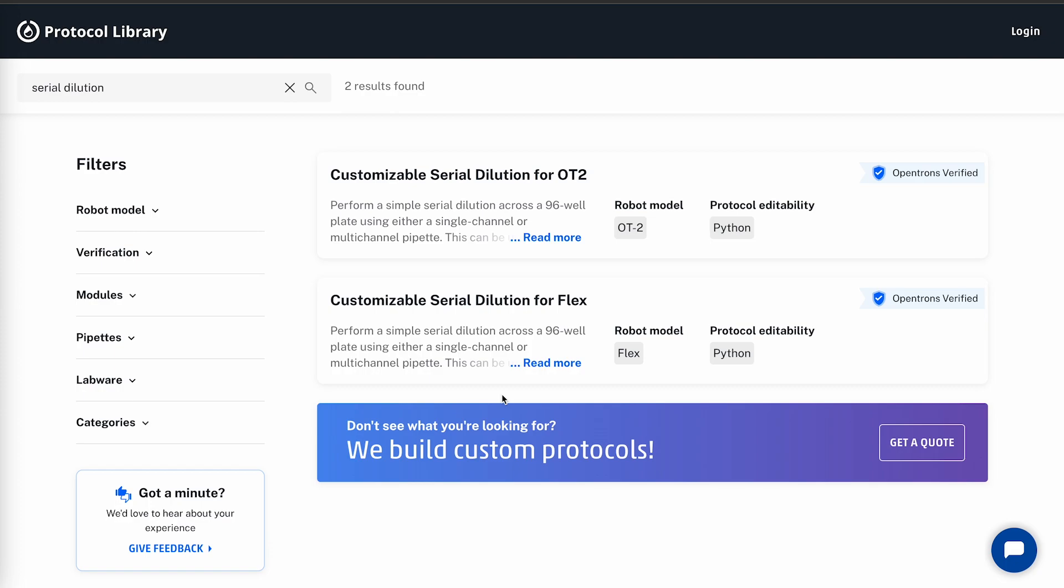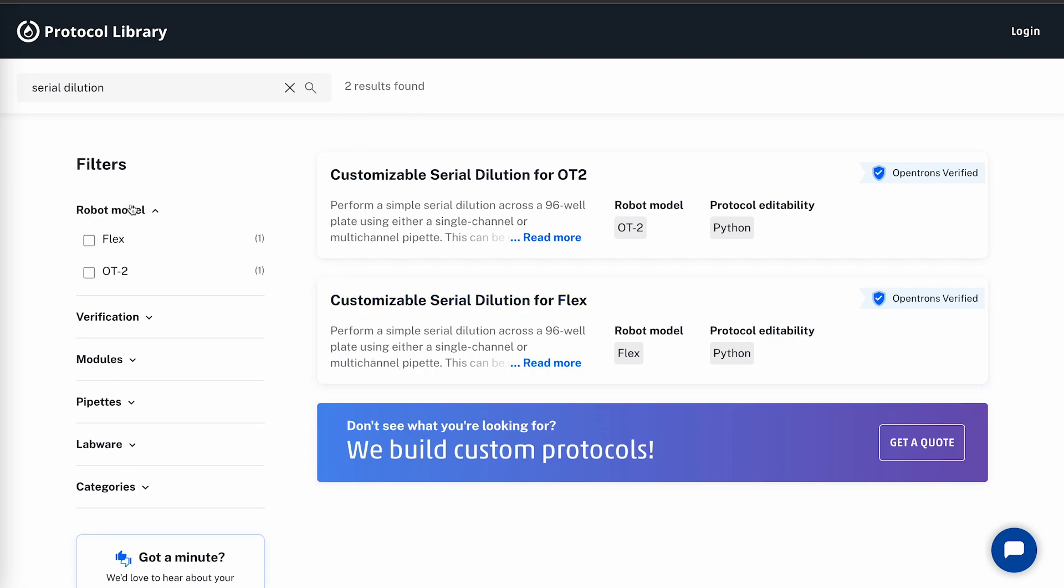There are two protocols for my search, so it's easy to see which one works for the Flex. If I did use a search term that had more results, I do have a few ways to filter the protocols. I can filter them by the robot I'm using, the verification method, modules being used, pipettes being used, labware being used, or the category of my application.